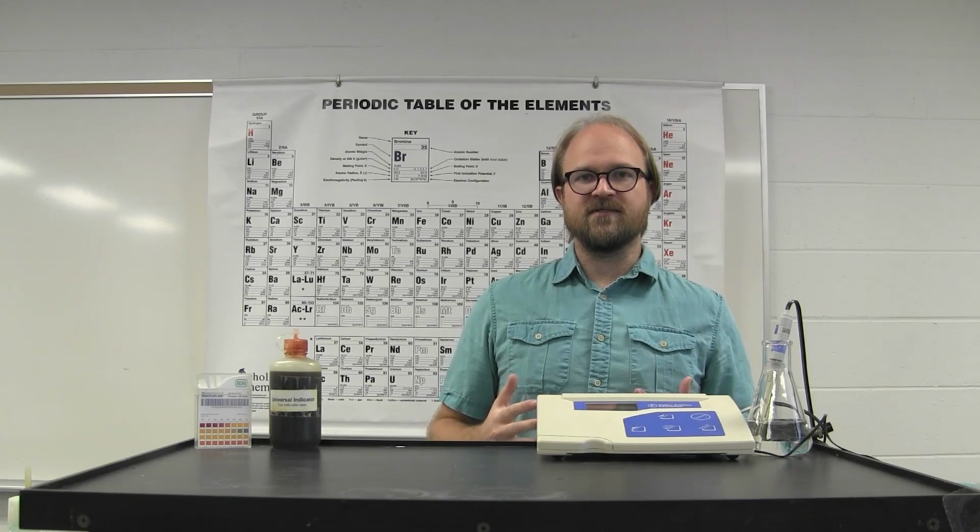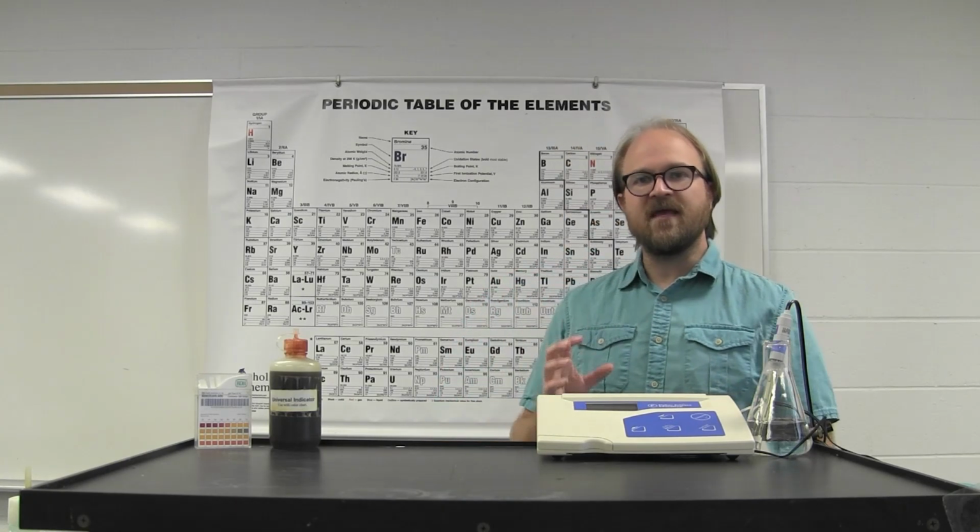for varying solutions. It also looks at the equilibrium reaction of these acid-base reactions. You've already looked at equilibrium reactions in other types of chemistry and other types of reactions, and this focuses on the equilibrium between those acid and base ions as they react with each other. That interaction and that equilibrium between acid and base plays a critical role in the formation of buffers.